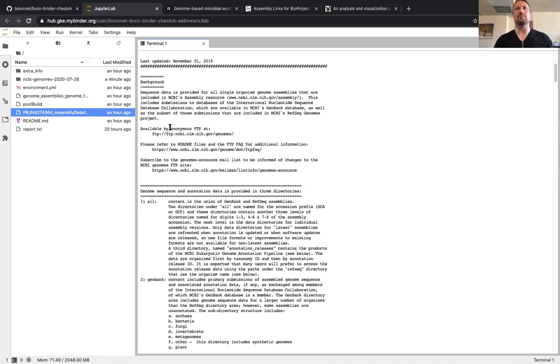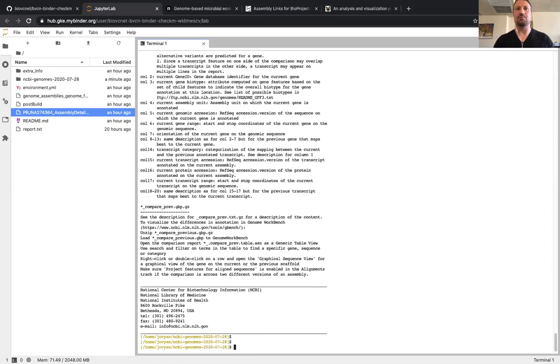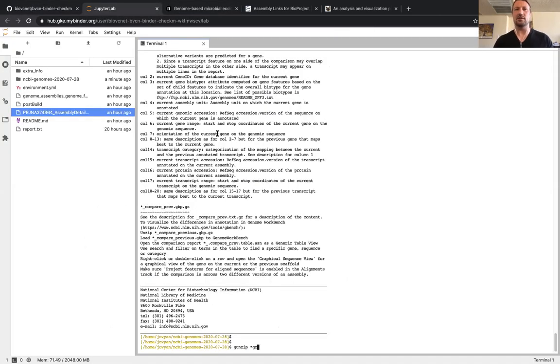One reason I wanted you to look at this file is you can download genomes from a single study by going through the website. You can also download these things in bulk from the NCBI genomes page. We'll not do this now, but it is useful to have as a resource. All right, so from there we will unzip, oh, look at that, clearly I forgot that. We'll unzip the files in this directory.